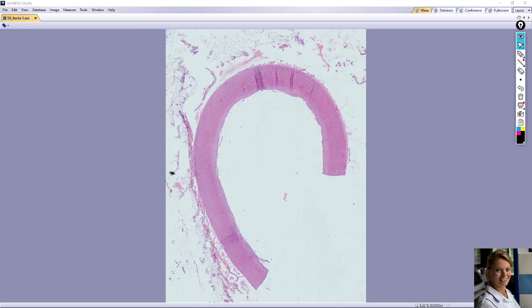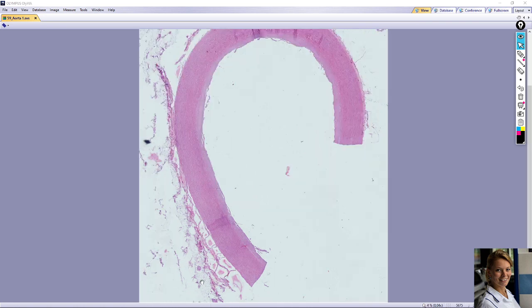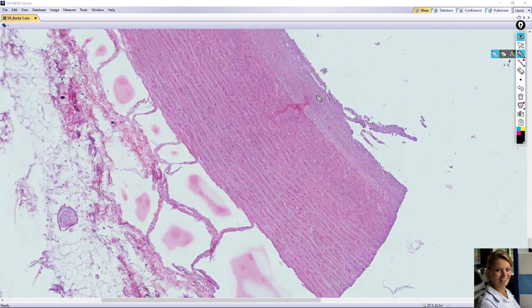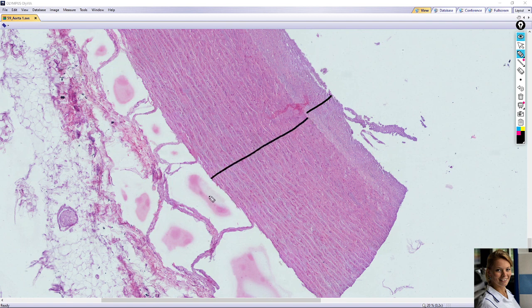In this video we will take a look at the slide of elastic artery. The slide is stained with hematoxylin and eosin. The wall of elastic artery consists of three layers: the innermost layer is tunica intima, the second is tunica media, and the outermost layer is tunica externa or adventitia.